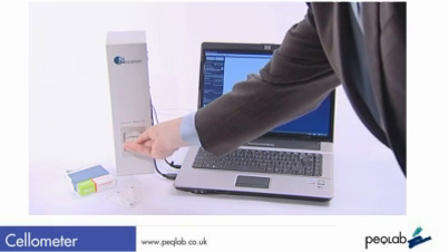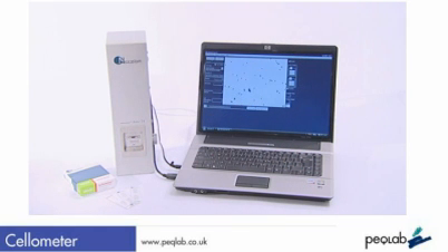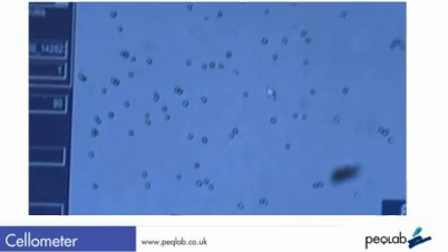Here's the Cellometer — very compact, about 30cm high — along with a laptop PC used to run the software and the system's counting chambers.